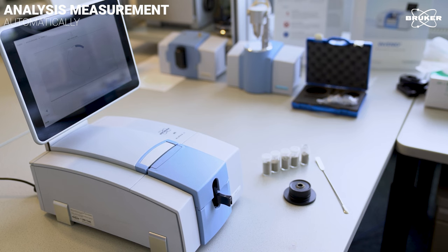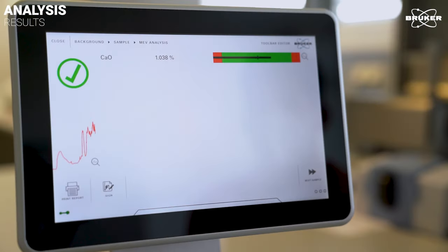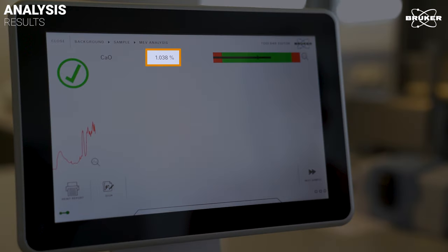After a few seconds, we get the result and a green checkmark indicates that calcium oxide was found. And because calcium oxide is present, the software has automatically started a quantification and the percentage of calcium oxide contained in the sample is displayed at the top of the screen – 1.038%.